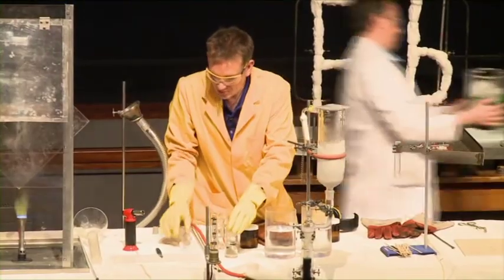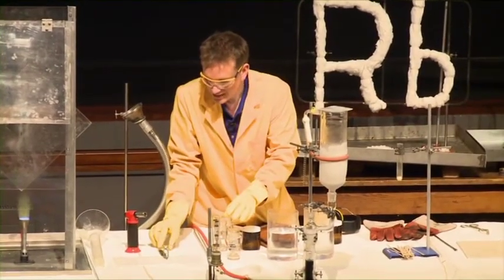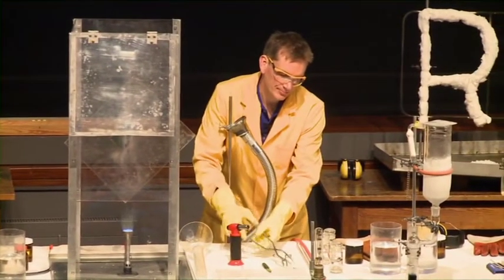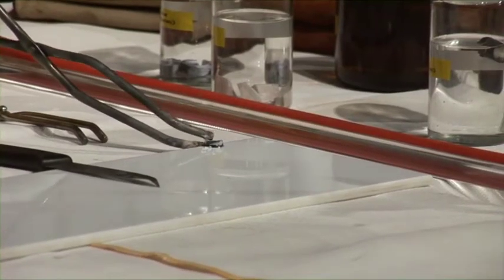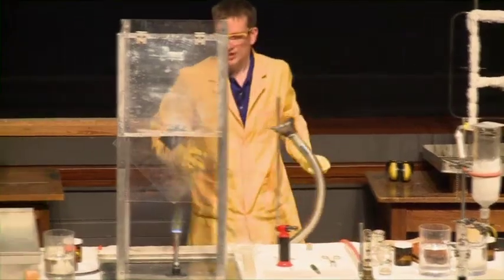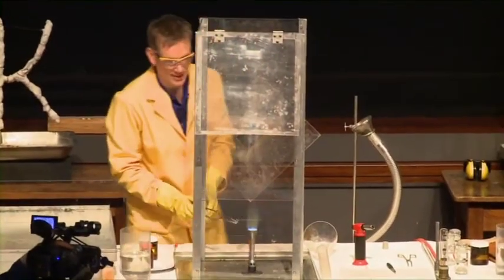So let's see if we can get this lithium to react with the gases in the air. I'm going to heat up some lithium. Let's take a little piece here and heat it in the flame.